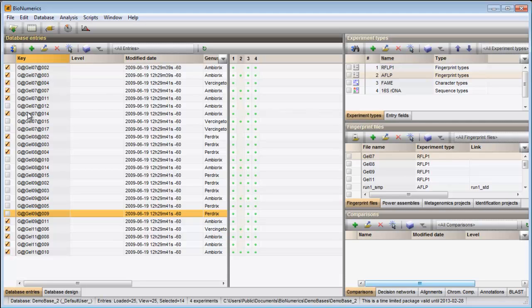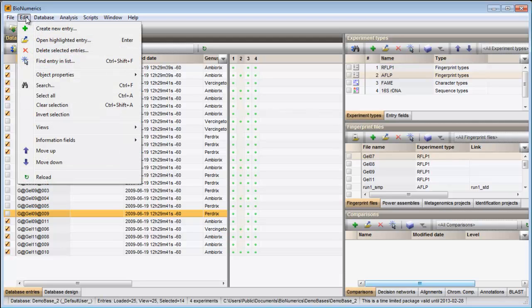All entries in the database can be selected at once with the menu item Edit Select All or with the CTRL-A combination on your keyboard.